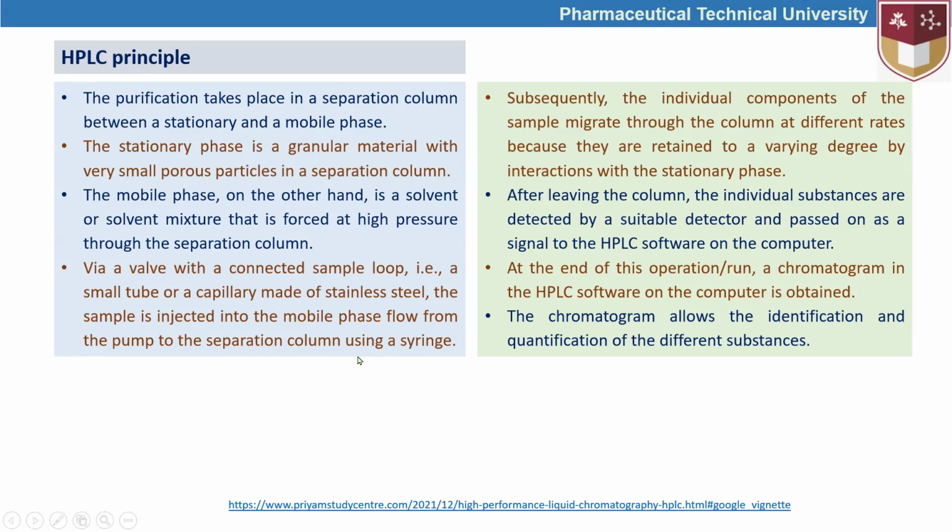And today, up to my understanding, many HPLC tools are equipped with the auto sampler. And if you want to buy the cheaper one, it can be possible to find the HPLC equipped with the syringe linked injector.